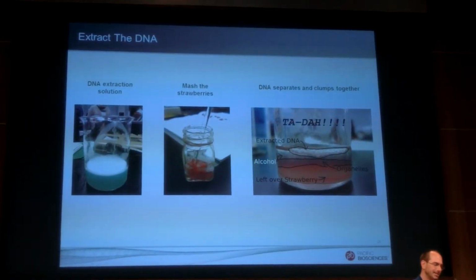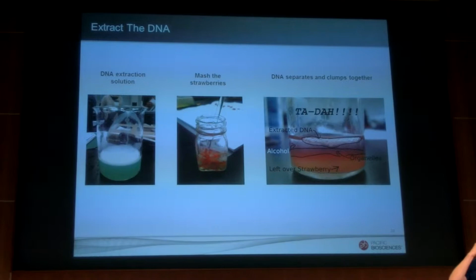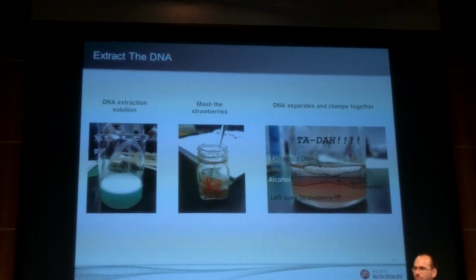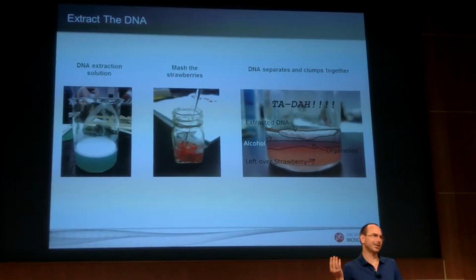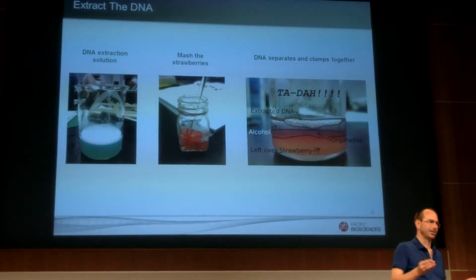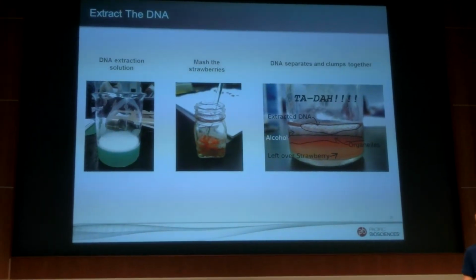Let me go back to DNA, kind of get you back to, okay, you always have to reset: what am I doing and where am I going with all this? So first off, you're trying to sequence DNA. You want to know what the order is. You're going to study a genome or a bacteria or some segment of a chromosome that you want to target.